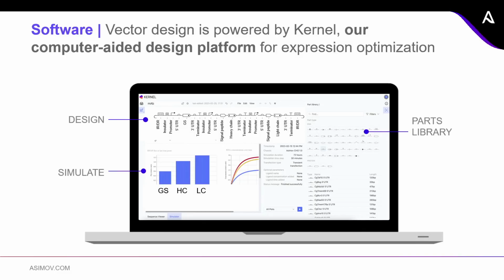For example, over here on the left is just a simulation of the GS, heavy chain, and light chain. So by doing that tailor-made to each molecule, we can actually develop the software and the predictions that are required.